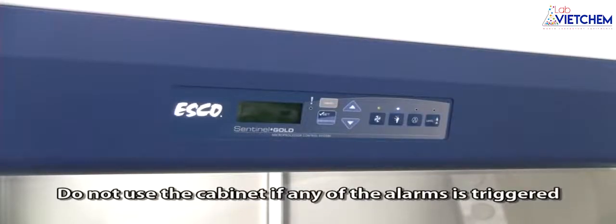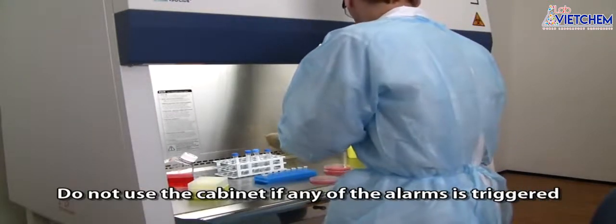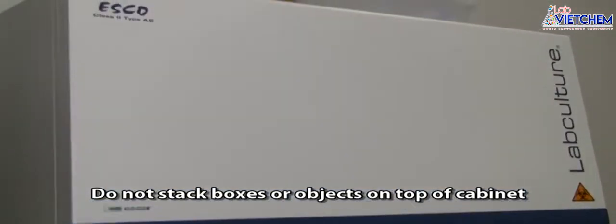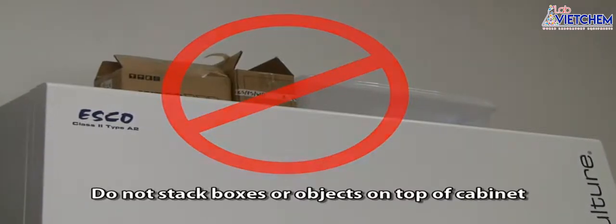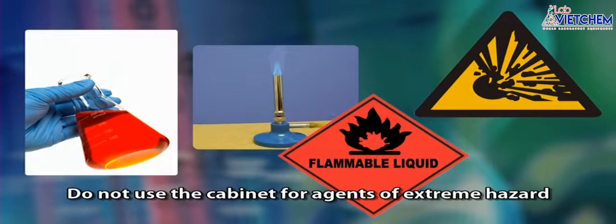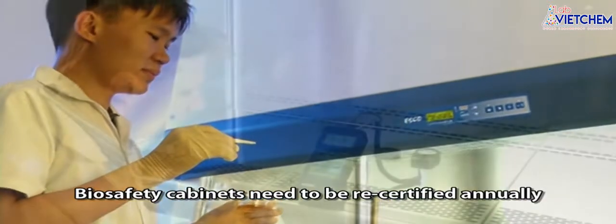Do not use the cabinet if any of the alarms is triggered. Do not stack boxes or objects on top of the biosafety cabinet, as this can damage the exhaust filter and disrupt the airflow. Do not use the cabinet for agents of extreme hazard, such as toxic, flammable, or explosive materials. Biosafety cabinets need to be recertified annually to ensure the cabinet is working within the safety limit.